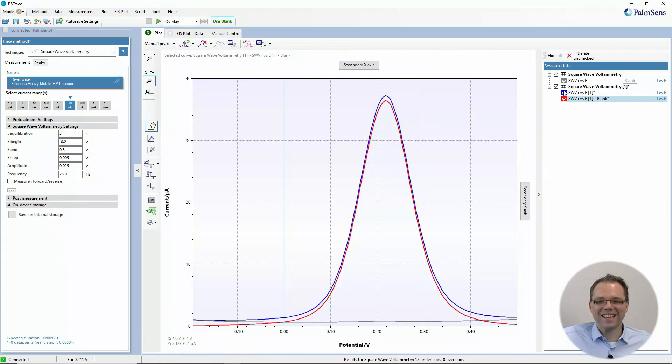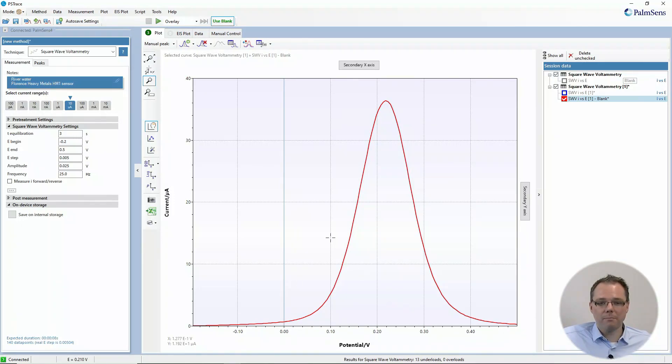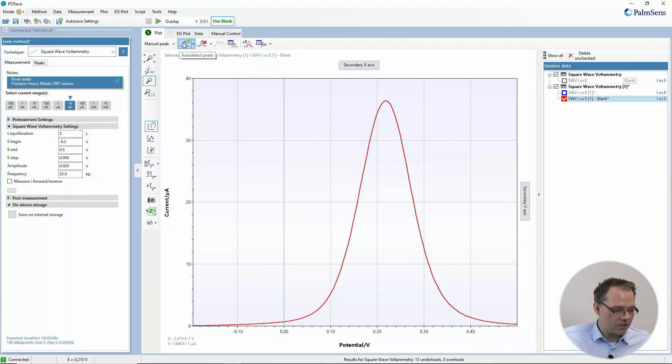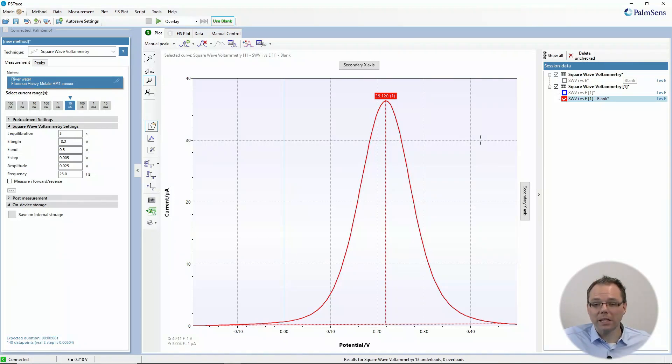But you see now we get a really nice baseline that's almost zero. If I do peak detection, you see that we can very easily find our peak. So this is an automatic way of doing it, but maybe you already have a complete dataset and you want to do blank subtraction manually after you've performed your measurements.